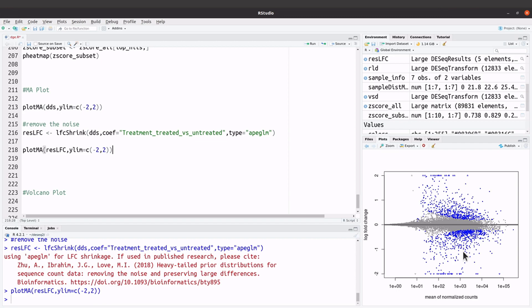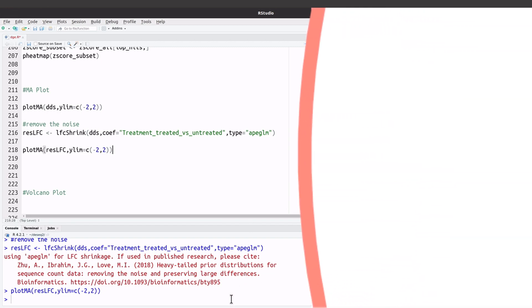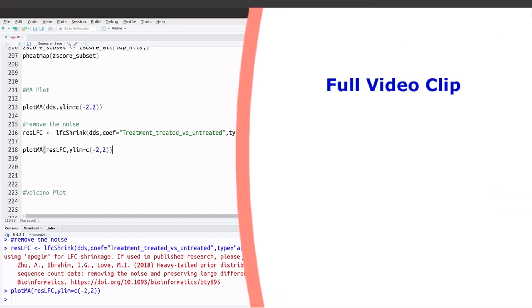That's how we generate MA plots using DESeq2. We first generated one where the noise was included, then we removed the noise and generated the other one. That's how we generate an MA plot when working with DESeq2.